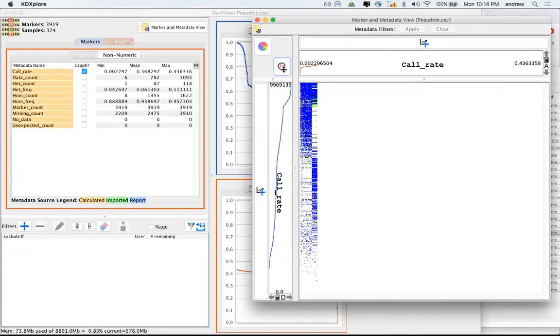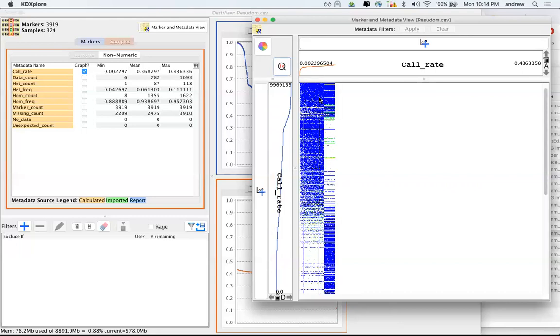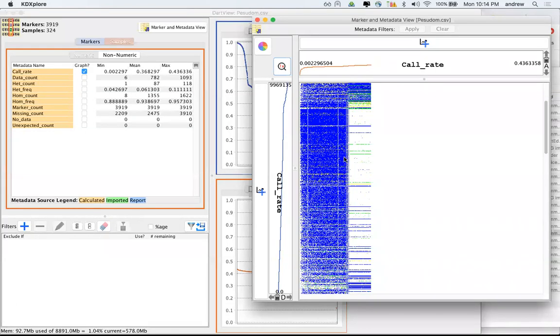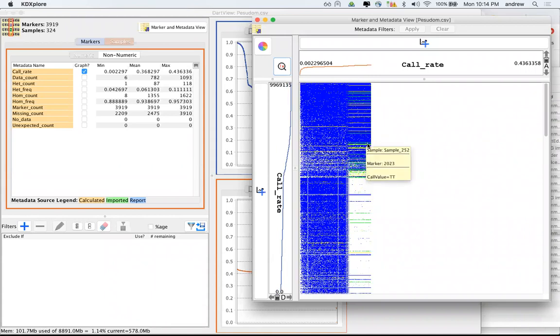You may have noticed that now that I've sorted this data a little bit, we see some sort of segregation occurring here. If I was to guess, there are two distinct populations in this data set. And so I'd like to explore further what this effect is.